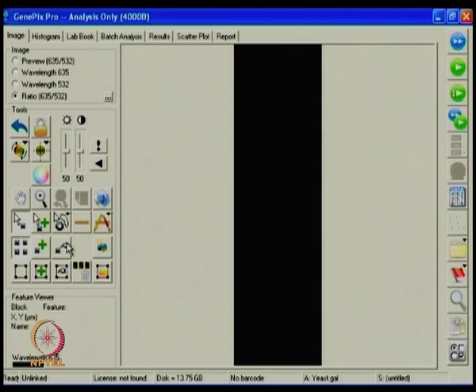These block and feature positions are recorded in the GAL file, and then the information or annotation is given to each spot. So the GAL, that is the gene array list file, essentially contains the X, Y and the number of columns, and also the information of each spot, how they are annotated and placed on the chip.